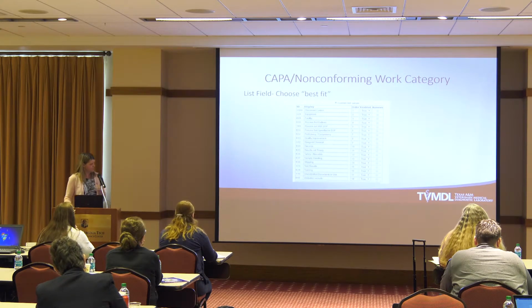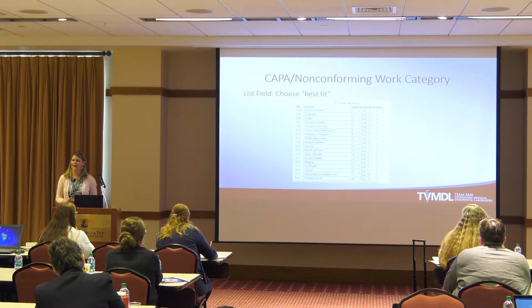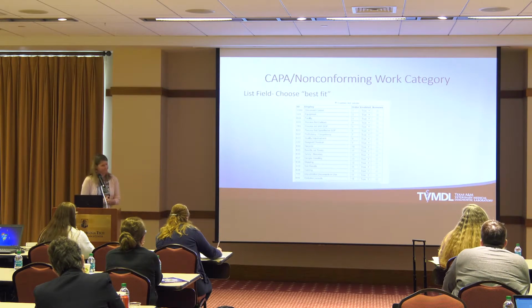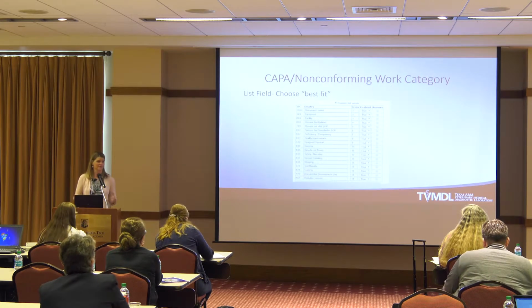So sometimes they'll come to us and say, which one do you think that this is? And so we'll assist with that. But this is what we have over time determined to be the most common categories of nonconformances. So document control: using the wrong document, wrong revision, an obsolete document, process not in accordance with SOP. That's a pretty broad topic.